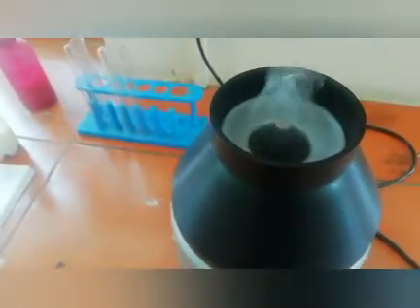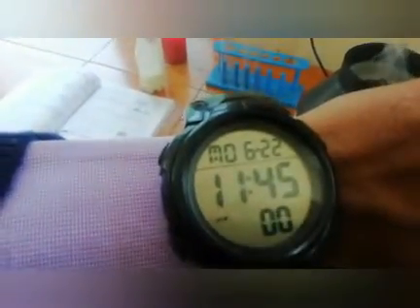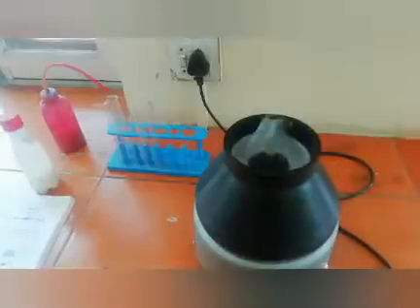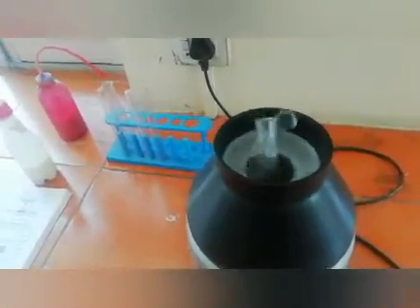Okay, so we will just take 1 minute. So after 1 minute you can see what is happening. So let me see.